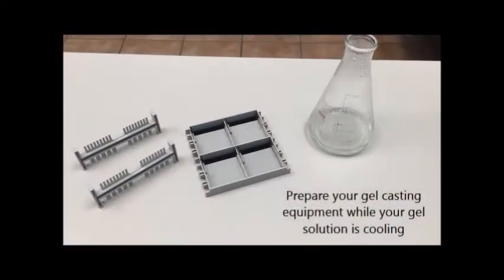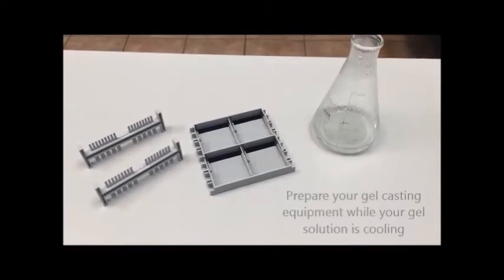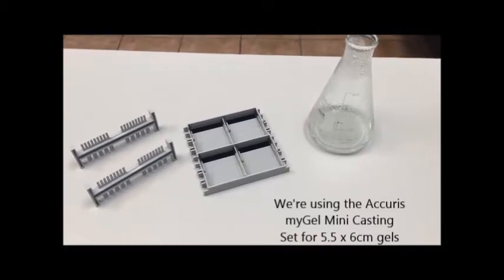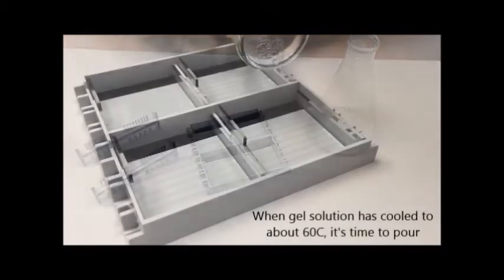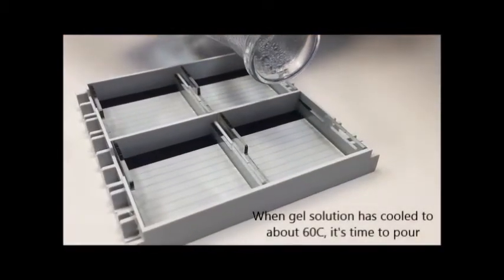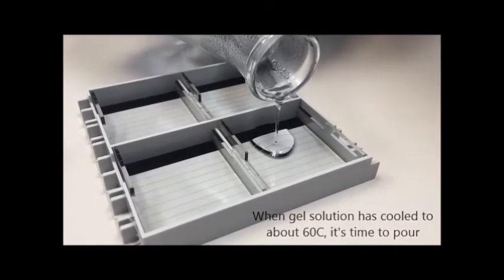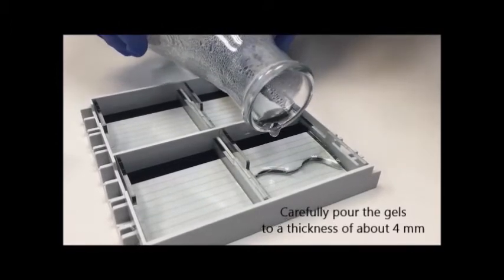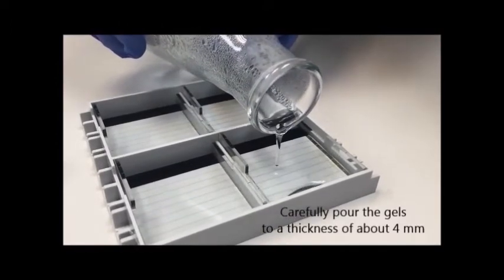The next step is to prepare your gel casting equipment. We're using the Acuras MiGel casting set that comes with the MiGel system. It's important to let your gel solution cool to about 60 degrees before pouring, otherwise you can warp the gel trays. Carefully pour the gels to a thickness of about 4 mm.